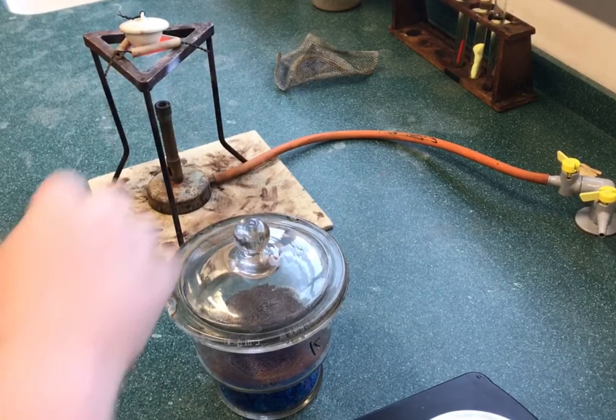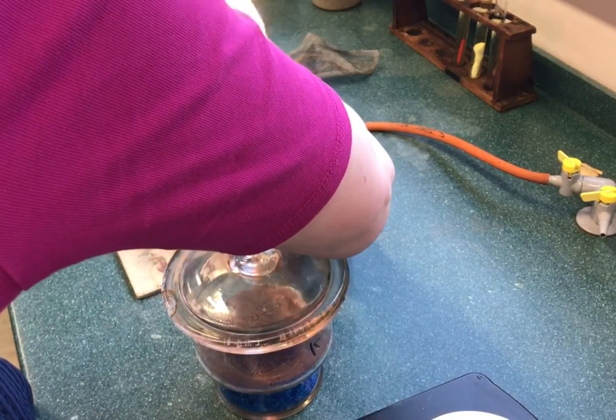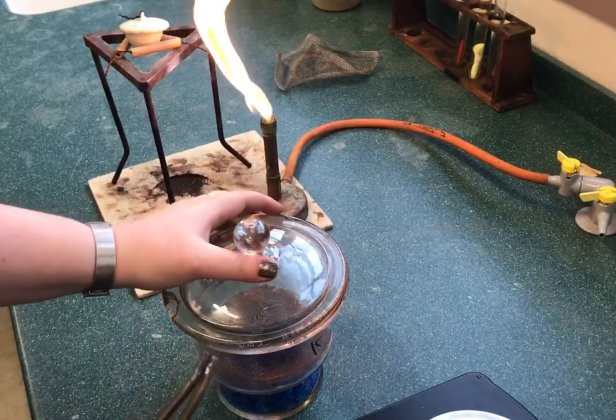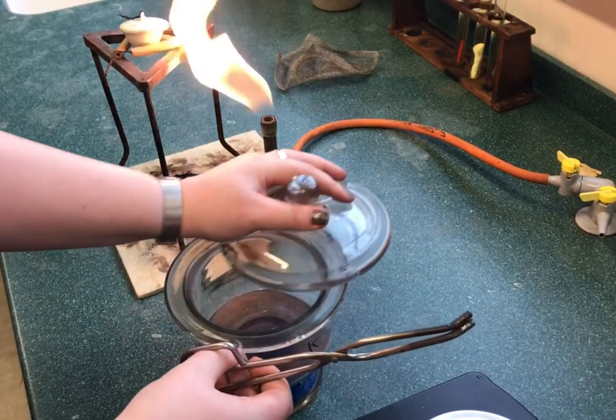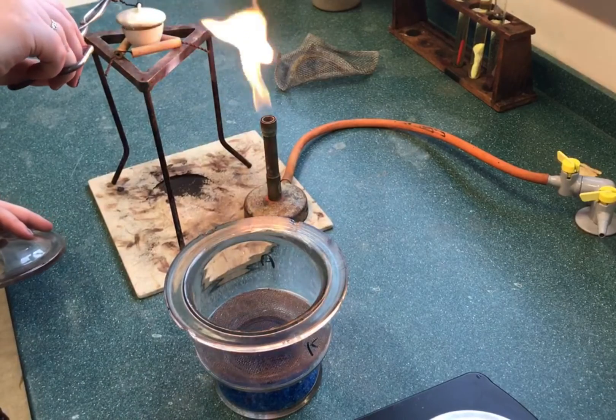After this time the crucible is removed from the heat and allowed to cool inside a desiccator. Cooling the barium chloride inside a desiccator allows it to cool without absorbing water. The desiccator does not aid the drying of the barium chloride.